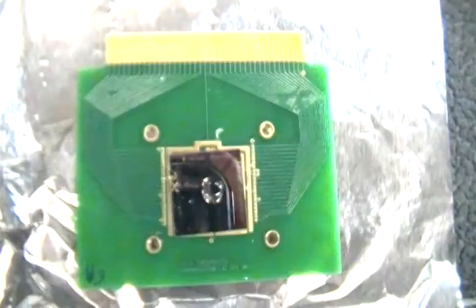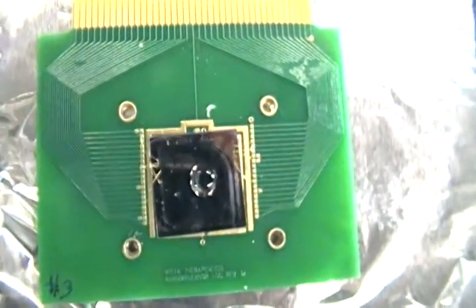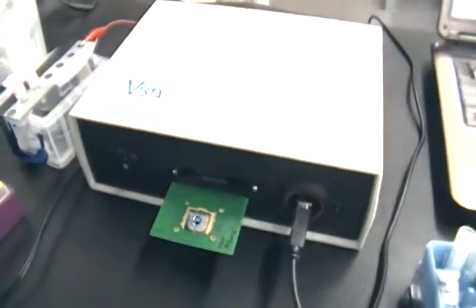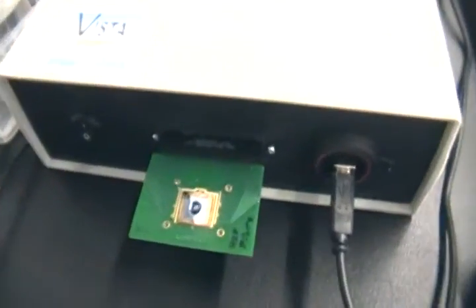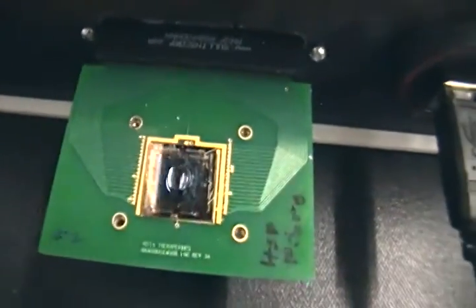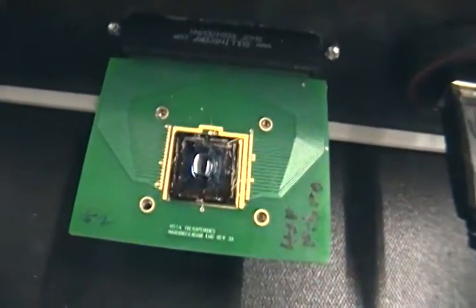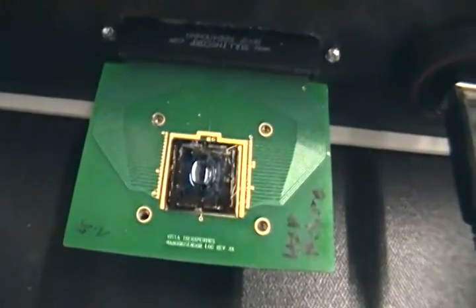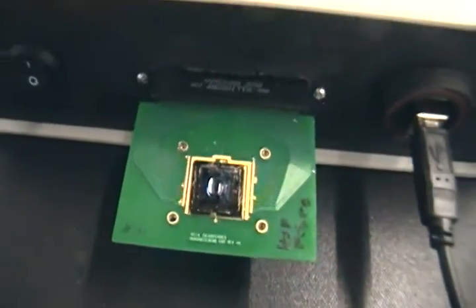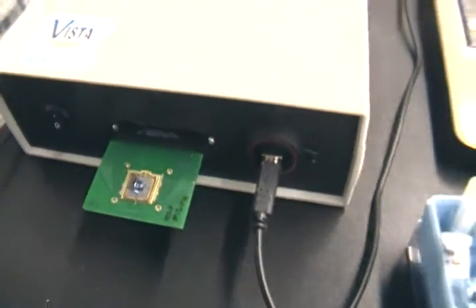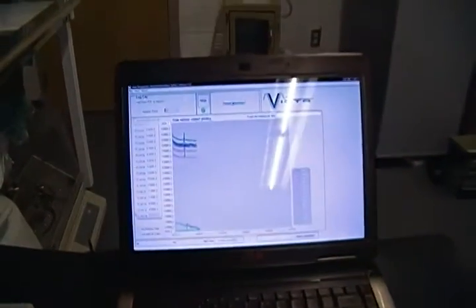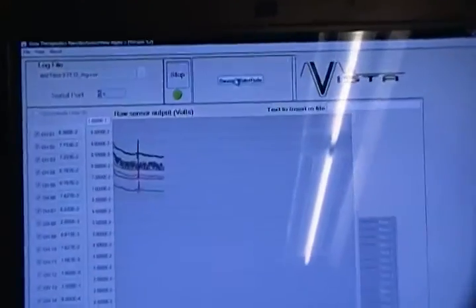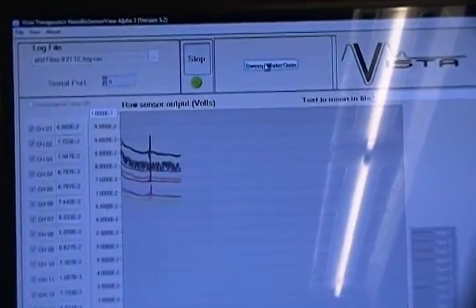And this one actually has an aptamer on it, and I'm letting the aptamer rehydrate. We often run the experiment using a syringe pump, but that's too slow for our purposes today, so today I will actually just use a pipette. This is actually a top-down card. We made this chip almost two years ago by e-beam lithography. We functionalized it with aptamers, aptamers actually against two particular proteins, heat shock protein 27 and fibronectin. Nothing particularly special about those, just showing that we can.